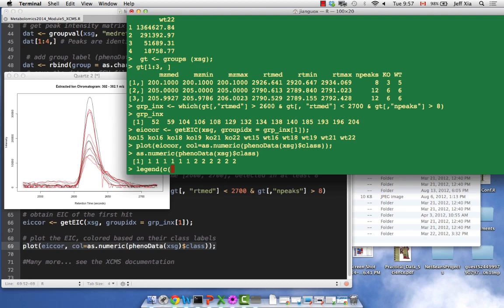Is there any input parameter? What do you mean, you want a legend? Yeah, the function is called legend. You just need to specify, for example, where you locate it, at the top, and what's the name, what you put there. I couldn't do it out of my mind. I also need to see what the grammar is. I'm the same as you guys. So you do question mark legend. Yeah, but my computer doesn't have it. So I assume legend is where you locate it. Legend dot.